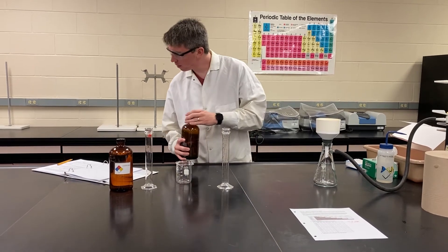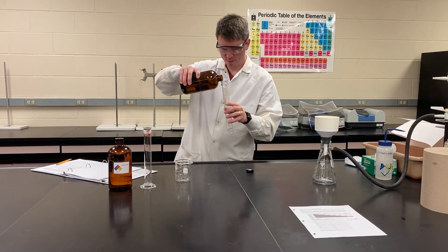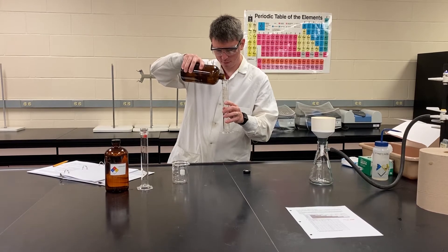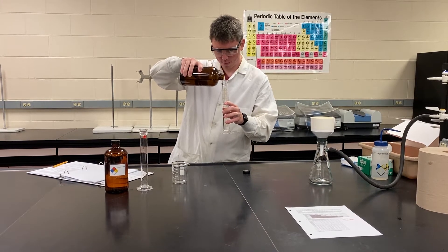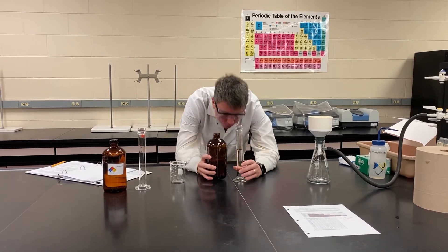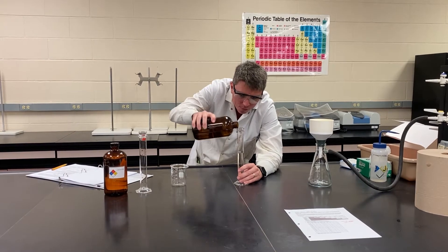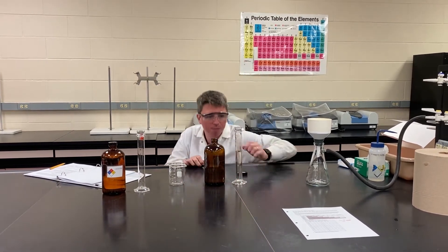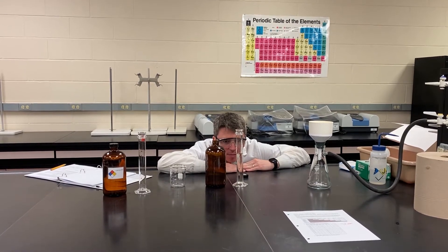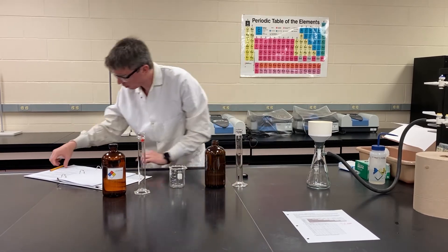We need about 70 milliliters of potassium chloride. As always, record the exact volume that you're using. It's a little low, but 68.0 mL.